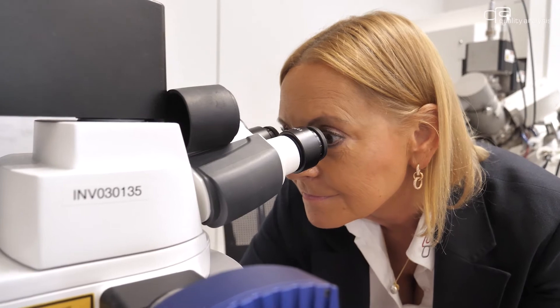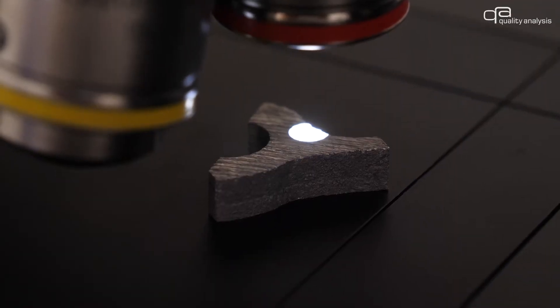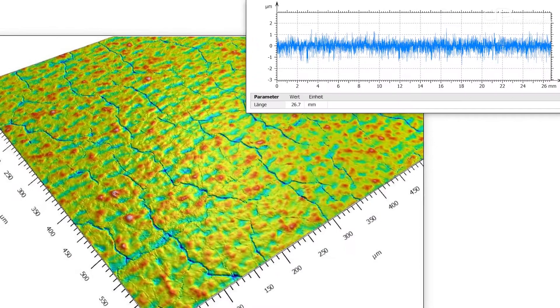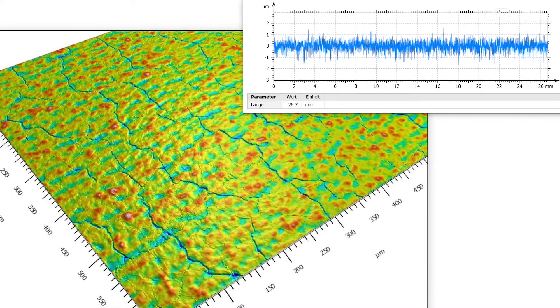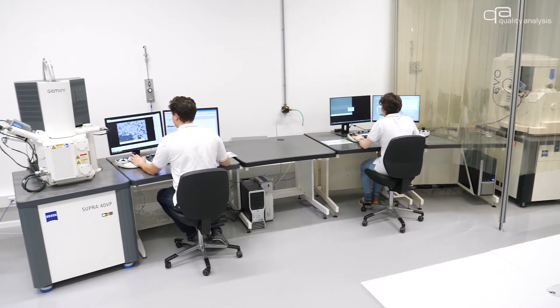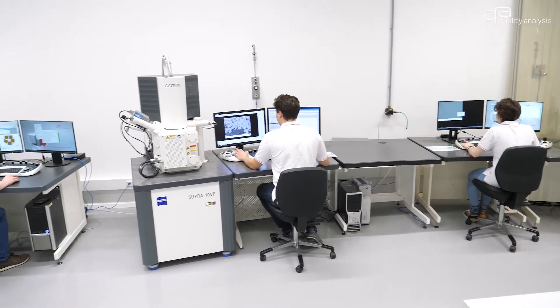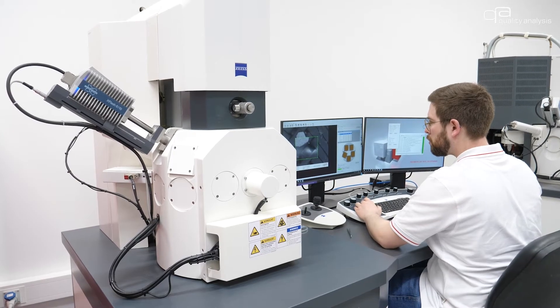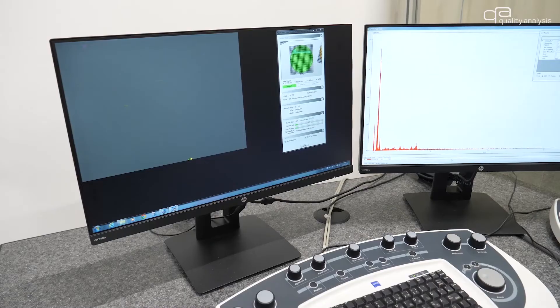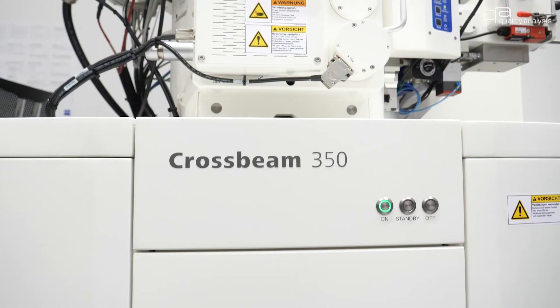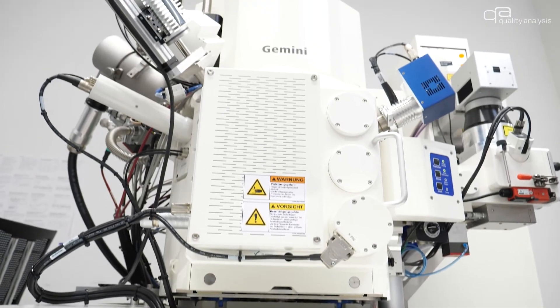Laser scanning microscopy allows us to perform precise analysis to characterize surface topographies down to the nanometer range. An even deeper and more comprehensive insight is provided by our four high-tech scanning electron microscopy systems. Tungsten, field emission, and a cross-beam system with focused ion beam are available tailor-made.